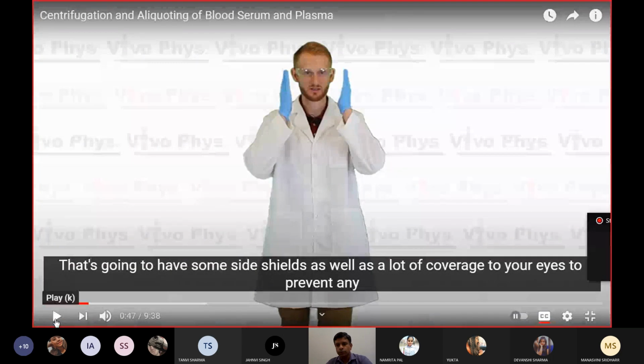So students, is it clear? So whenever you are working in a diagnostic lab, right? This is the kind of precaution that is required. Okay. So as you just heard, shoes are important because shoes will cover the whole of your feet, right? If you are wearing slippers or sandals, then there is a chance that a drop of blood may fall on your skin, on your feet.